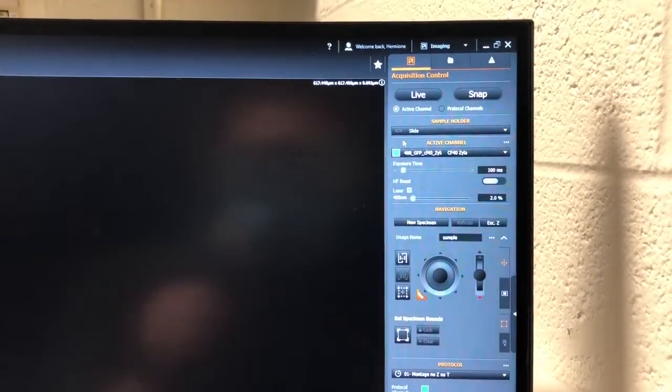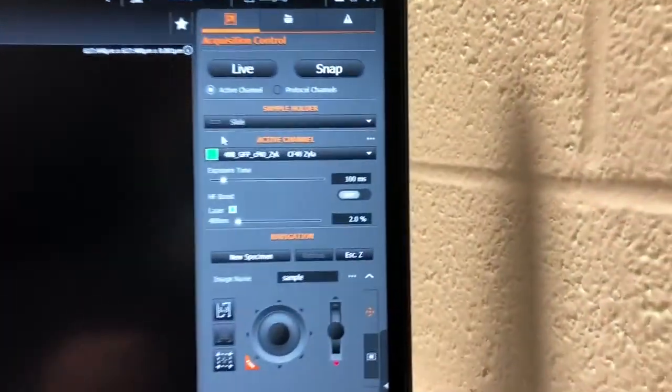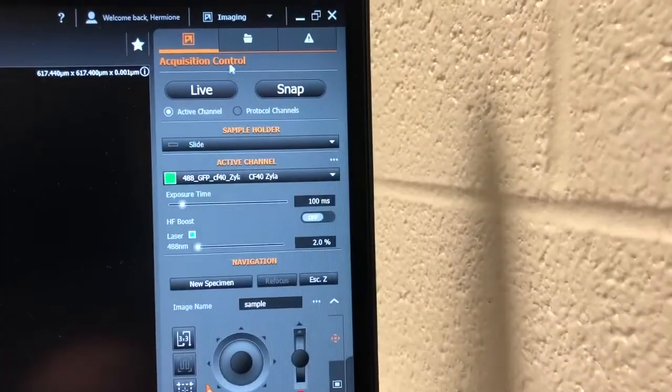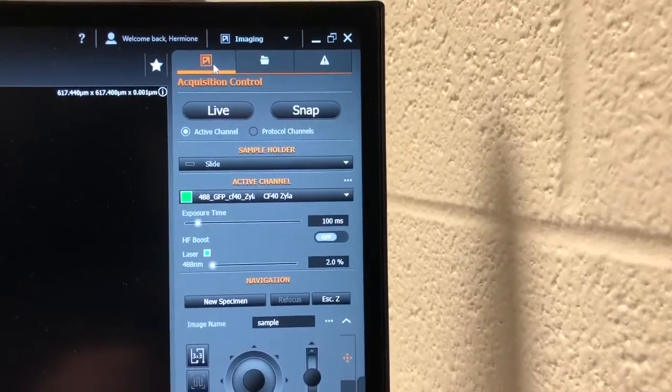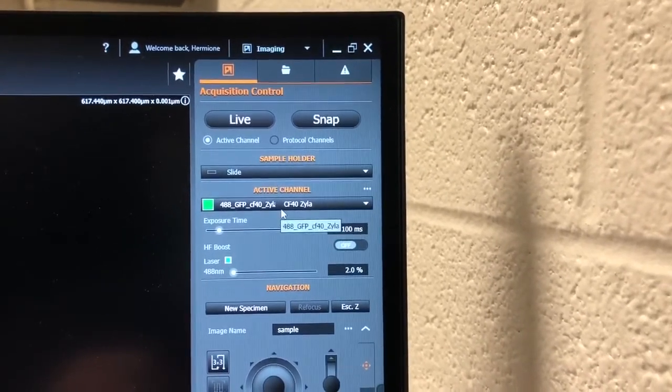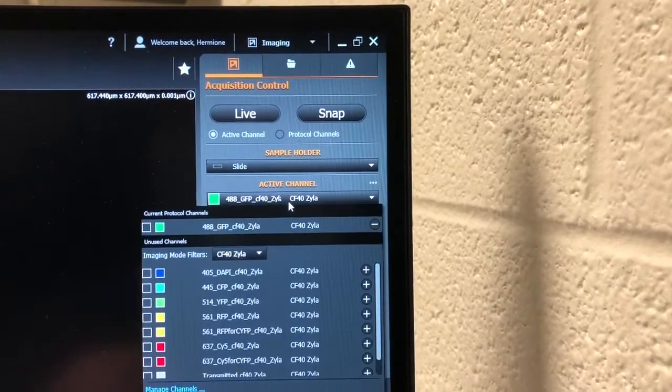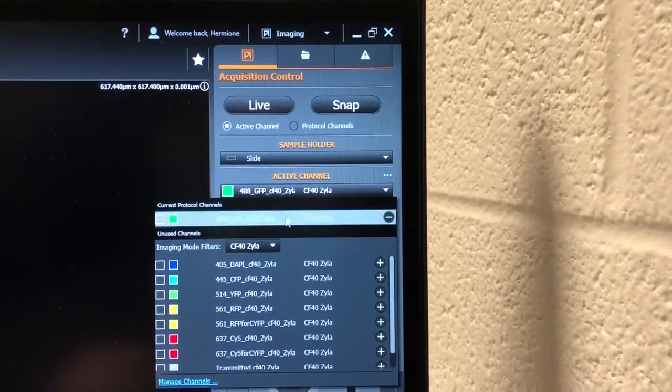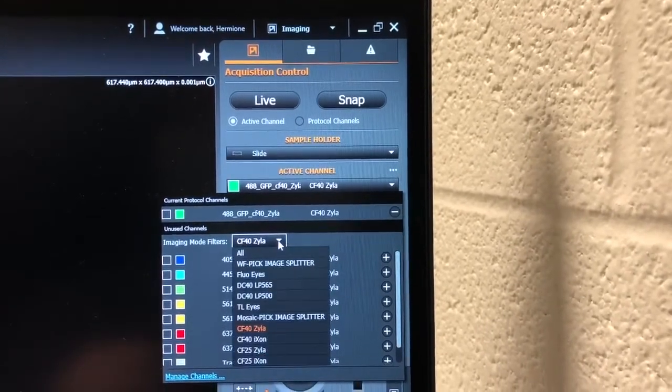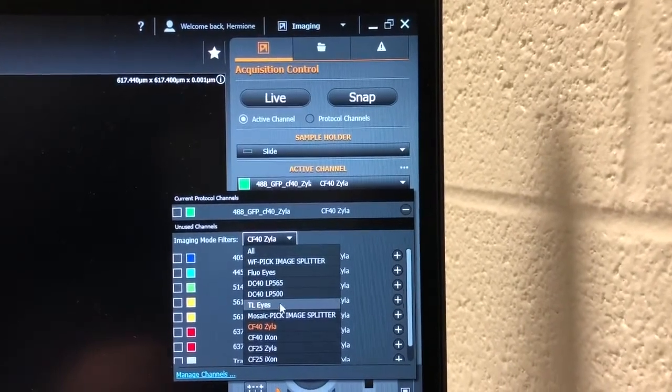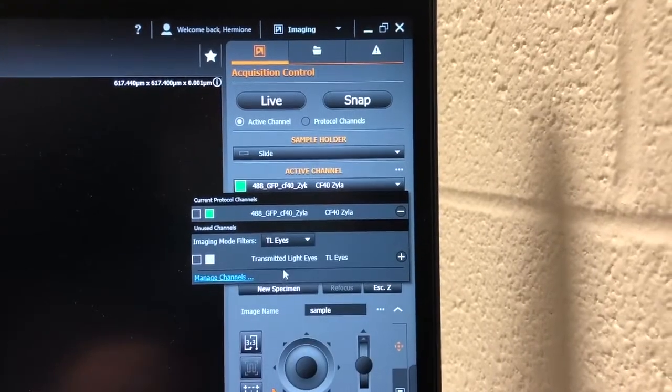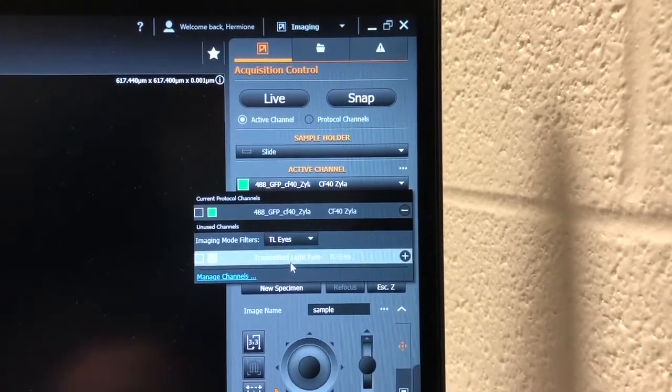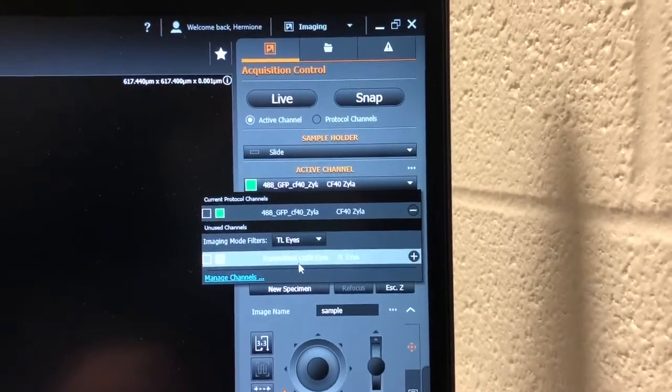To look at a sample by eye using Brightfield, we're going to make sure we're in the Acquisition Control tab, go to the Active Channel section, click here, we are going to select the imaging mode called TL Eyes, and then select the Transmitted Light Eyes option.